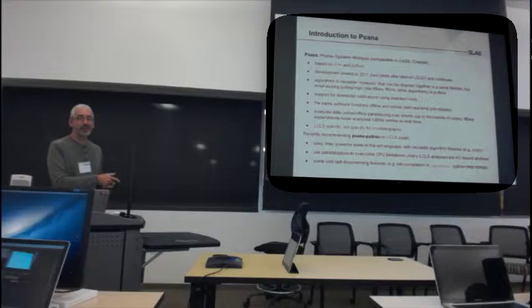We have the same idea as CASS, that you can have these reusable modules that can be chained together in a serial fashion. But defining the modules in the chain ends up being like a complicated language, in my opinion. And so we are emphasizing more now with Psana putting logic, like filters on your events, just in Python. A filter is an if statement, you know? You say, if the shot energy was less than this, I want to throw away this event. That's an if statement. And it's much easier to put that in a line of Python than it is to have a configuration file of chained modules.